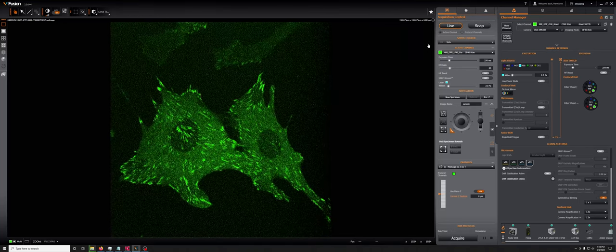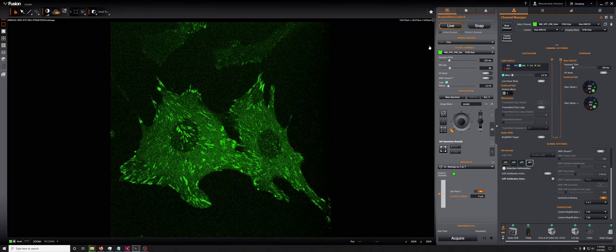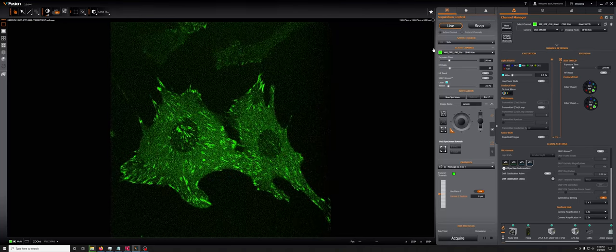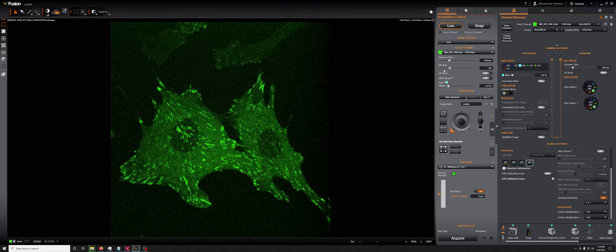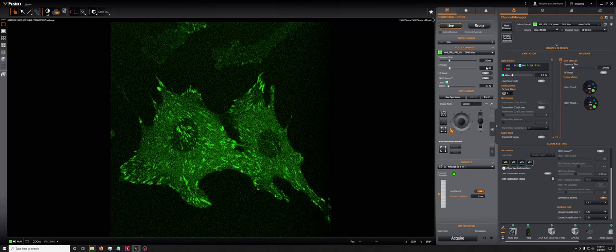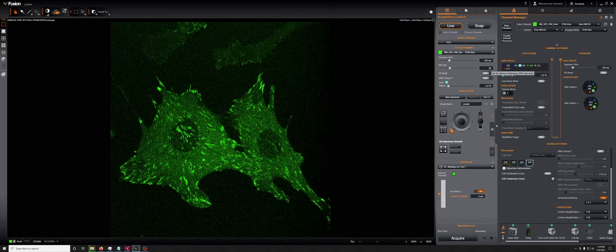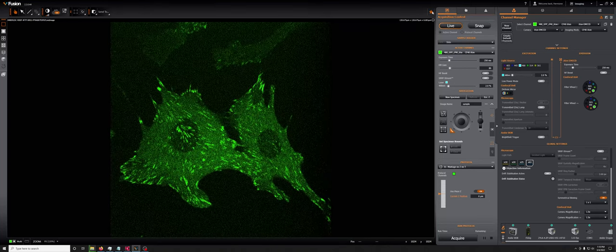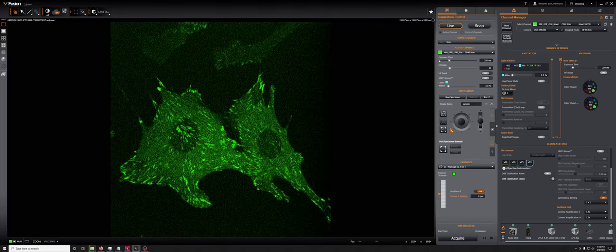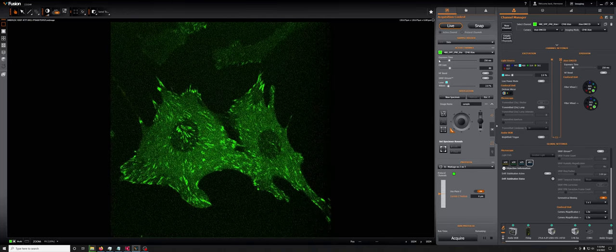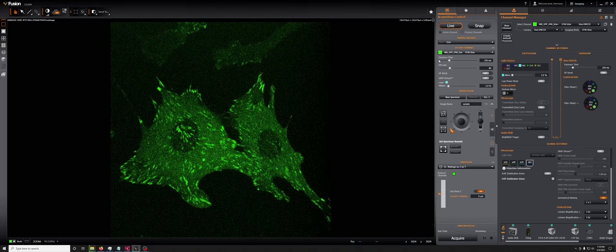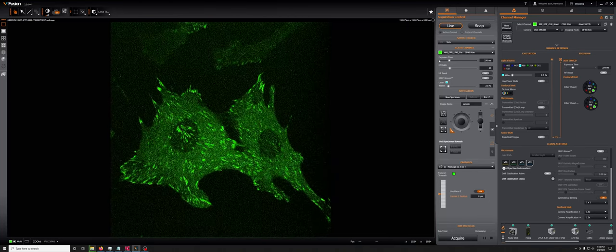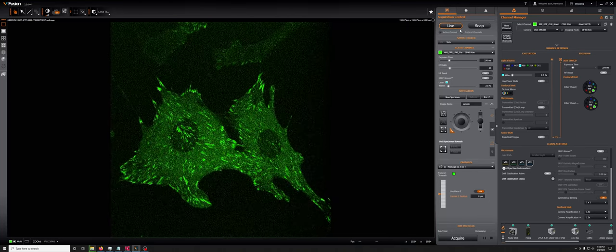So again, the thing that you're mostly going to do is the EM gain, but there is that other parameter which lives here, which can give you a small additional boost.